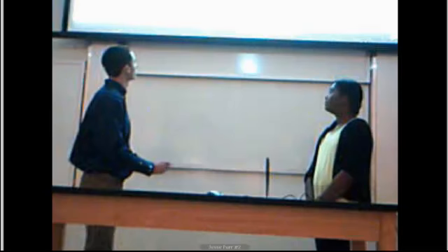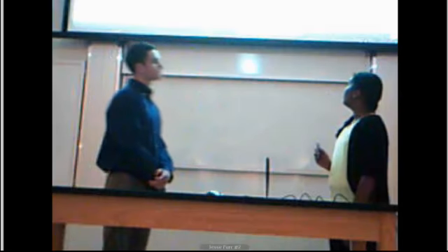And below is our graph of the limit of linearity with our R squared value and our linear fit. So a perfect R squared value would be 1, but we can't ever get to 1. So we try to get to 0.999, as many 9s as possible, and we got to 0.9953, which is pretty good.